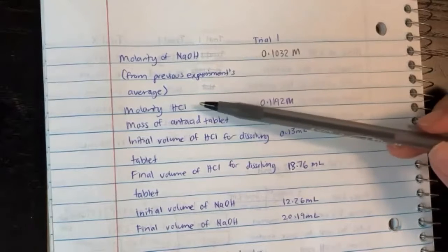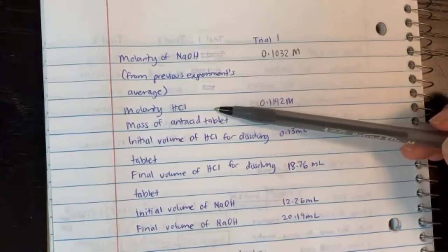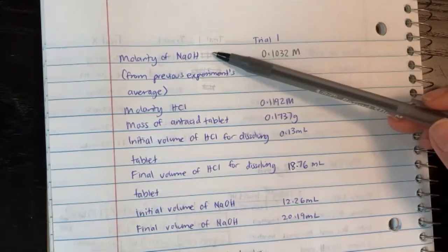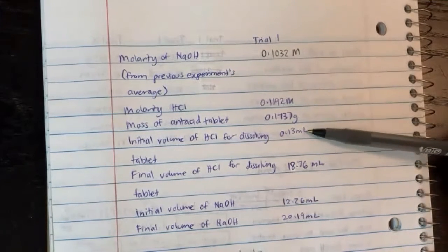So what we do is antacid needs to be dissolved completely in hydrochloric acid. So we'll put in excess, a whole bunch of hydrochloric acid, basically to make sure that even though antacid is basic, you put a whole bunch of HCl in, it's going to make overall that thing acidic, and then you can just titrate a little bit of sodium hydroxide to make it go to the endpoint, which is a light pink color.